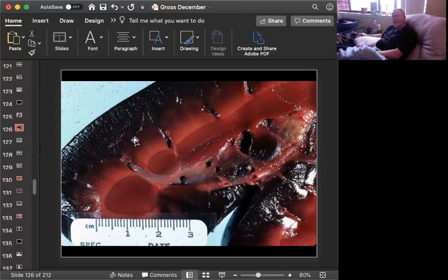It's almost black here. The other thing I want you to notice is that the pelvis is reddish. It's not yellow. The animal's not icteric. But this animal is undergoing a hemolytic crisis. The condition would be called probably a hemoglobinuric nephrosis.